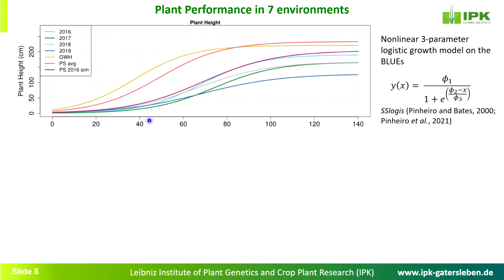So the images were taken around here. You can see that the plants in the greenhouse reach around 1.50 meters, 1.60 meters. In the average climate, they were already above 1 meter. And in the field environment and in the plant cultivation in the PhenoSpheres running the simulation, it was pretty indistinguishable in plant size. And this was true for the whole growth period. So the simulation came pretty close to this blue line, which refers to the growth performance of the year 2016.